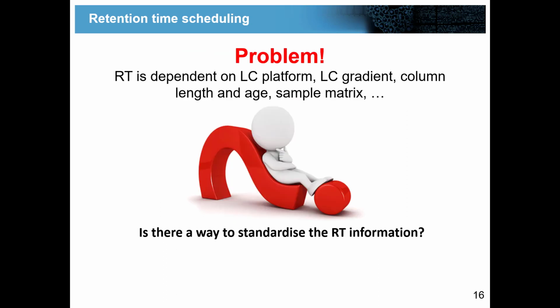And that is a big problem because retention time is actually something that is LC platform, gradient length, column age, sample matrix dependent. So if I tell you I measured a peptide with SRM that it was eluting at 16.3 minutes and you want to do it in your lab, this information is completely useless for you. And that's why it is super important, if you want to use this scheduling and chromatographic information, to somehow standardize retention time information.